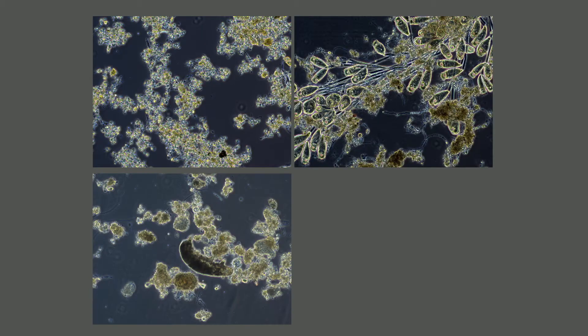Now broadly what you see down the lens of microscope can be split into four parts: flocks, protozoa, metazoa and filaments.